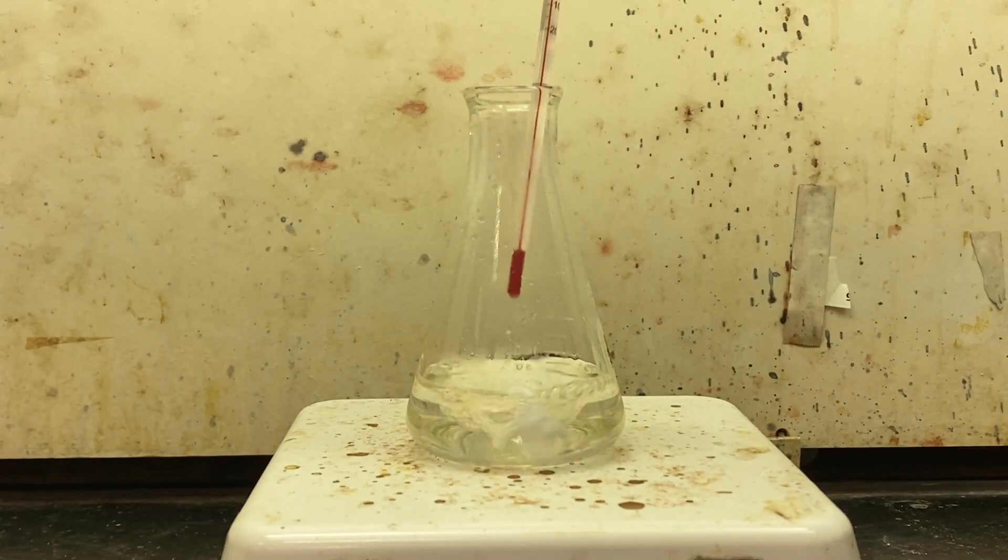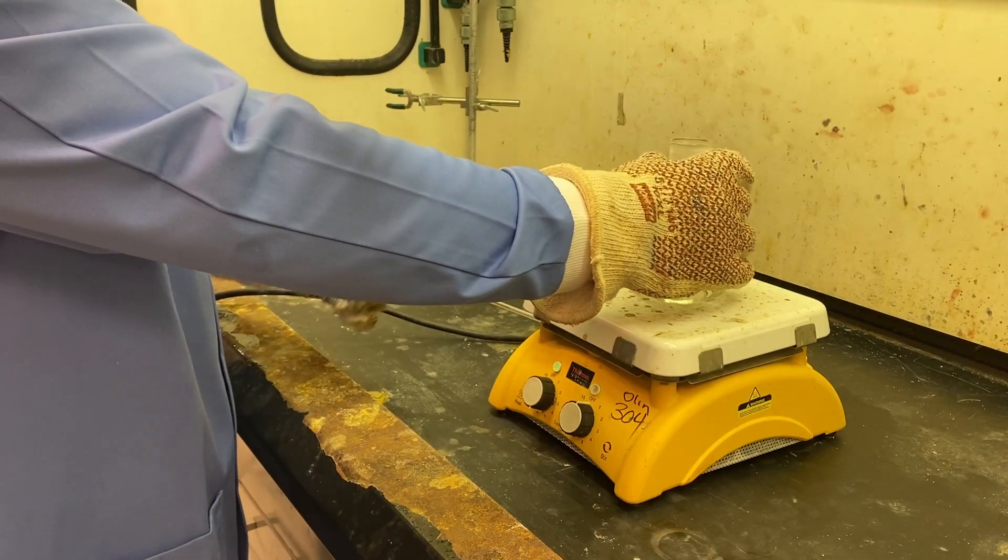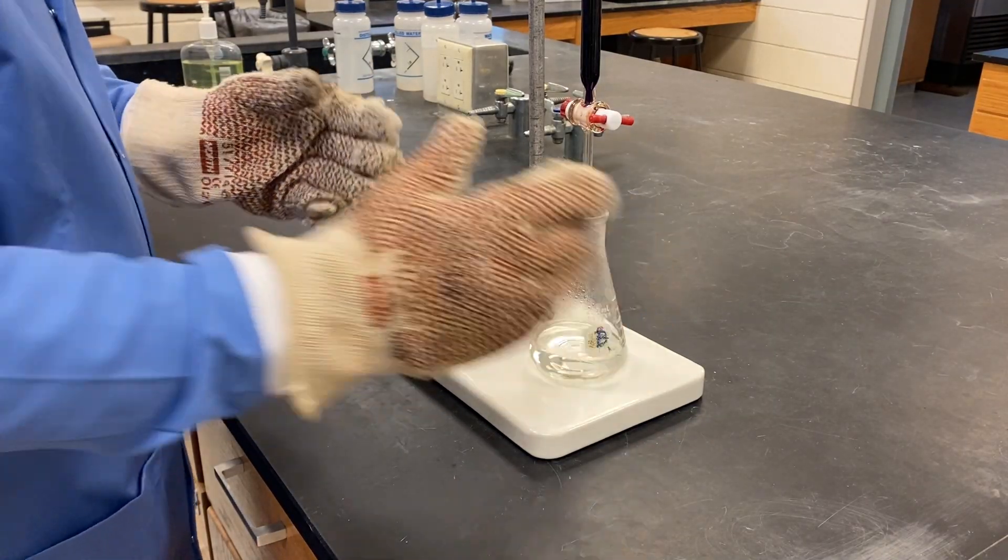Before starting the titration, the solution must be heated to 85 degrees Celsius in a fume hood. When moving the hot solution from the fume hood to your titration setup, you must use a pair of hot gloves.